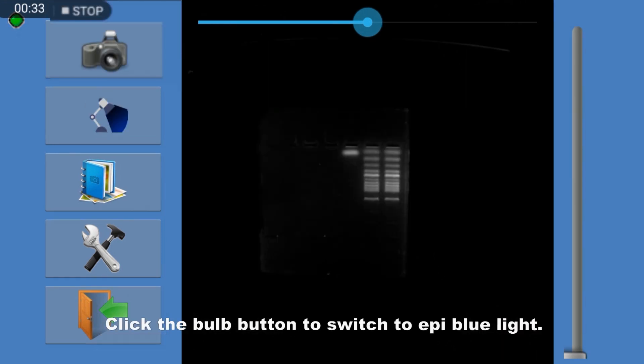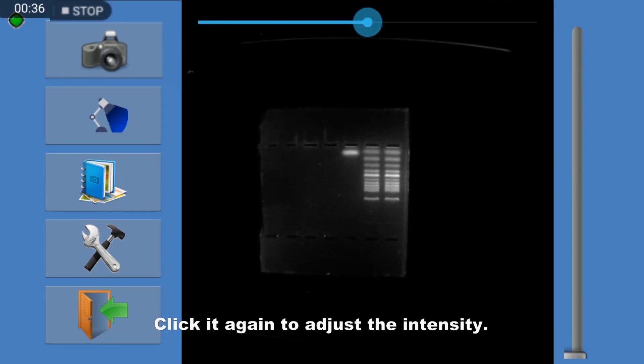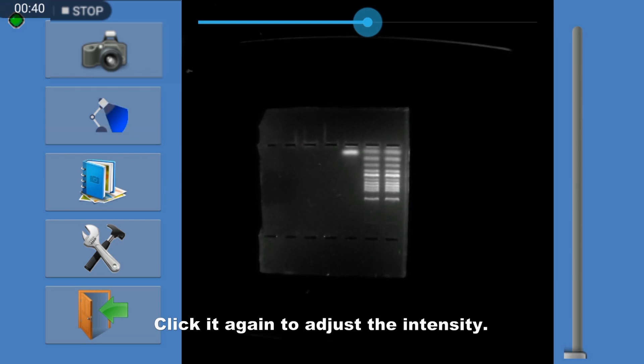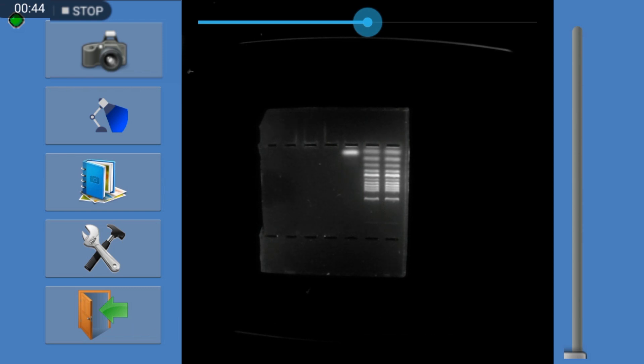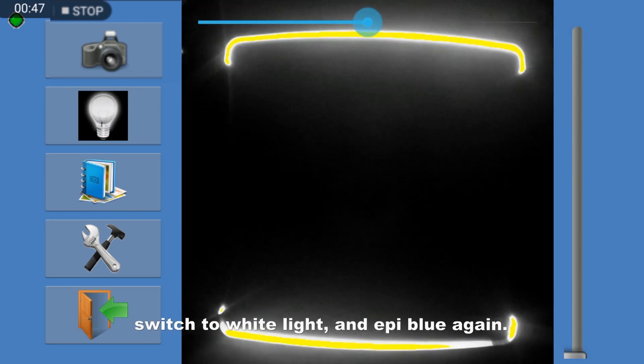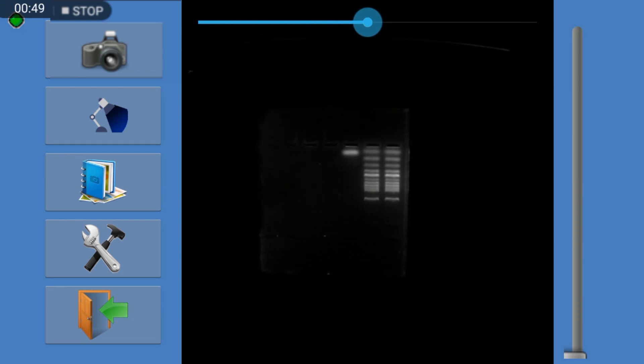Click the bolt button to switch to EP blue light. Click it again to adjust the intensity. Click it again to turn off the light. Switch to white light, and EP blue again.